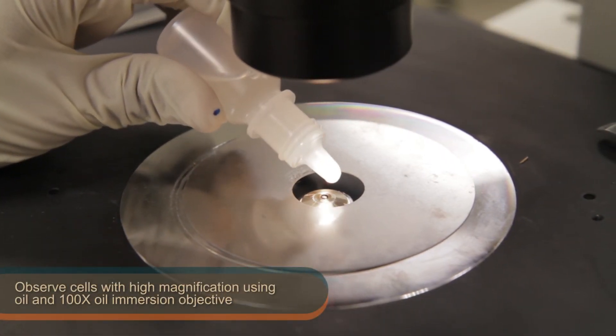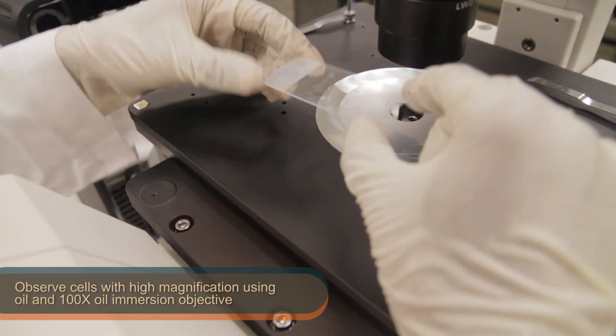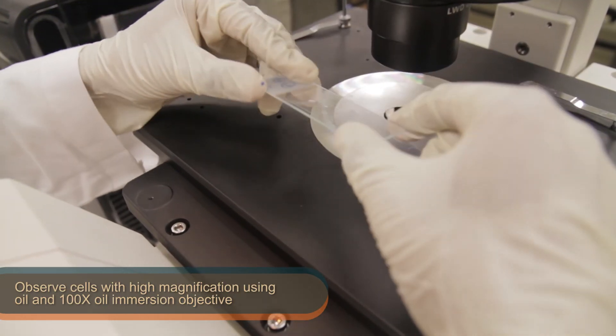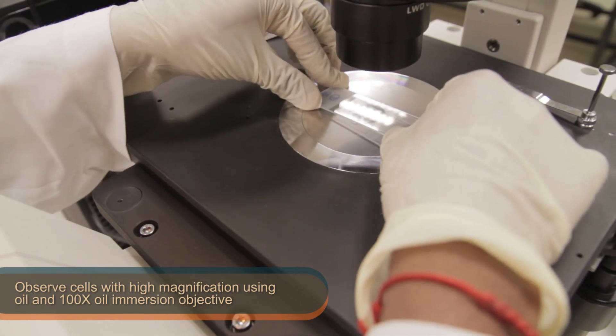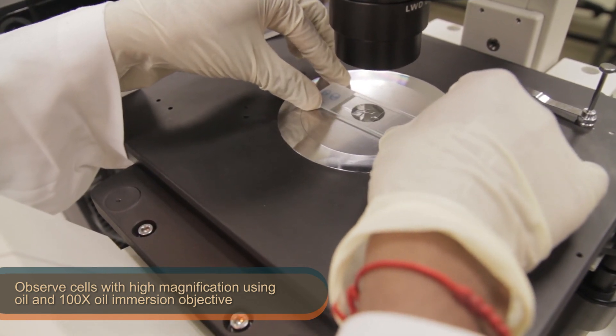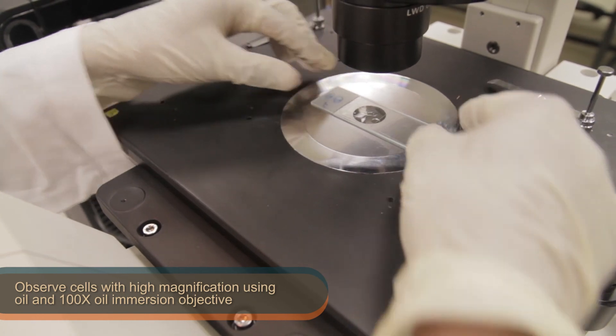Observe the cells with high magnification using oil as well as a 100x oil-immersion objective. When operating the inverted microscope, be sure to add the oil droplet to the lens instead of the glass slide.